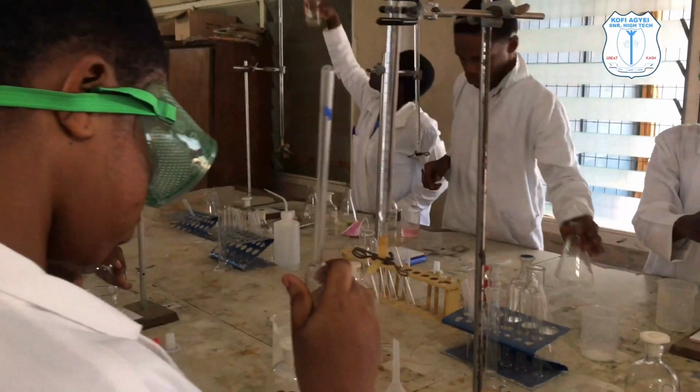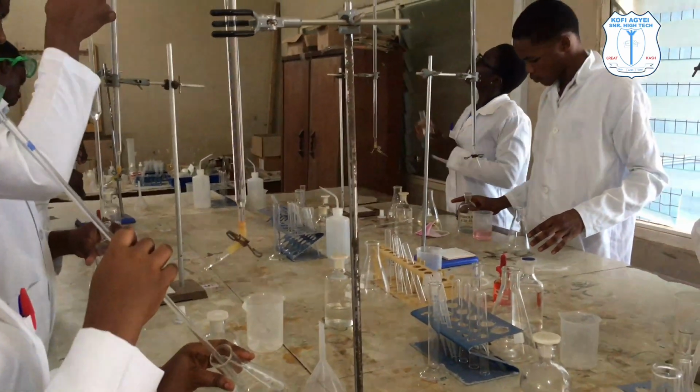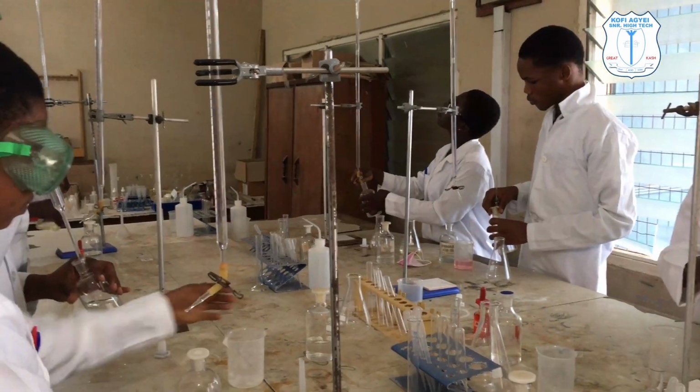Now the pipette, please. Make sure you set it like this, into the conical flask. How should you use this?